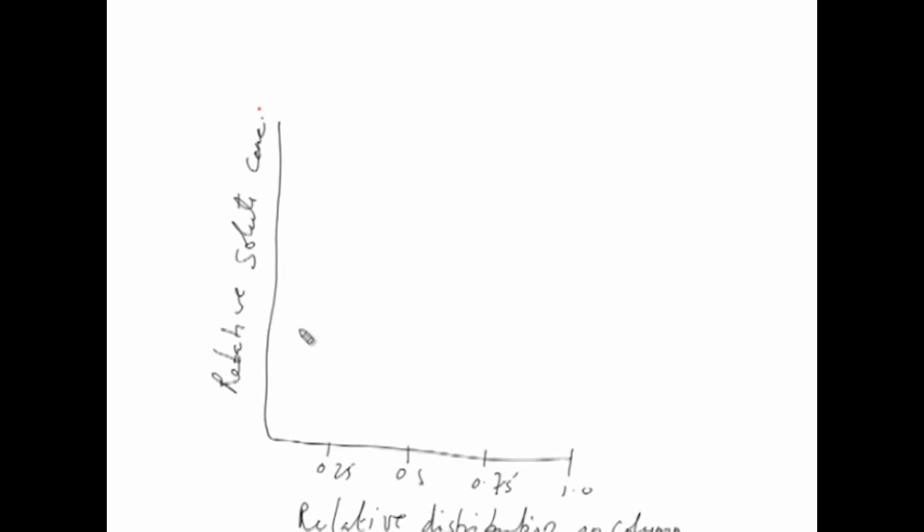What we are trying to show is how the number of theoretical plates will affect the peak shape, the type of peak of a particular analyte.